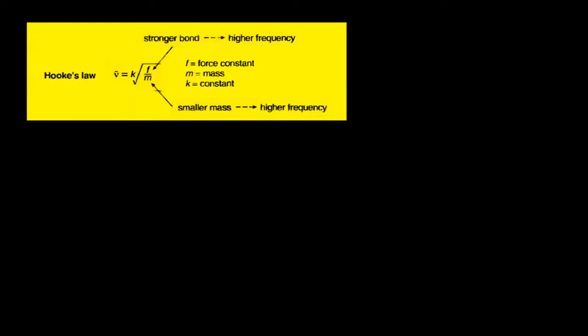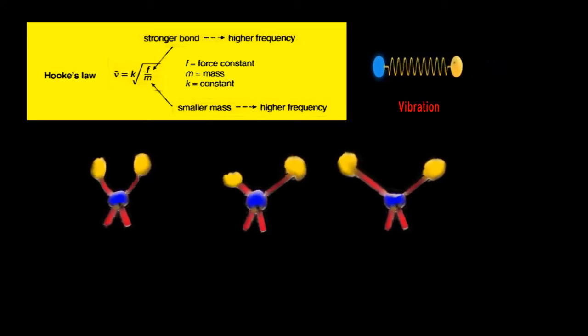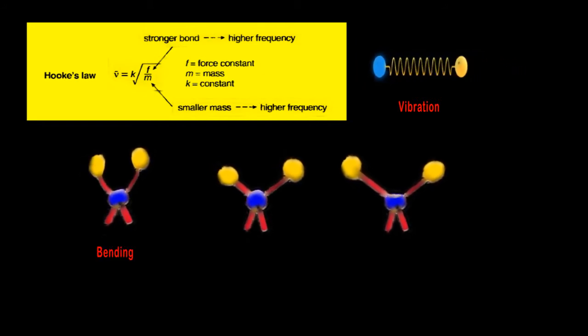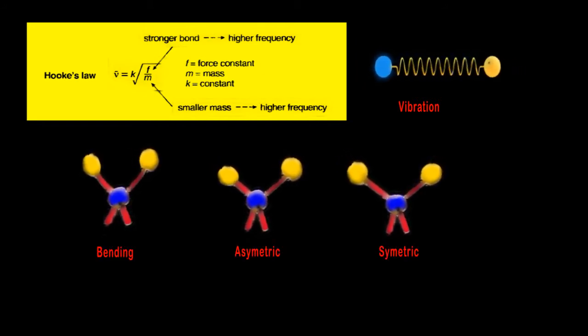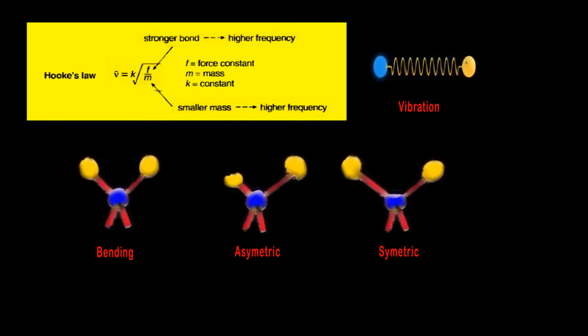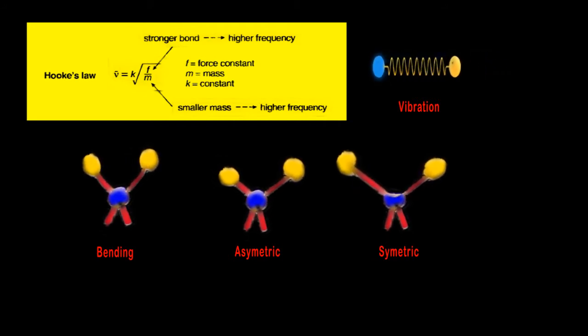Understanding the IR graph is very important, which we are going to see here. The principle of IR spectroscopy is based on Hooke's law with the bond vibration in the molecule. The bond vibration, as well as various types of vibration like bending, asymmetric and symmetric vibration, causes the molecule to absorb IR frequency. Moreover, the bond stretch could also increase the amplitude of the spectrum.